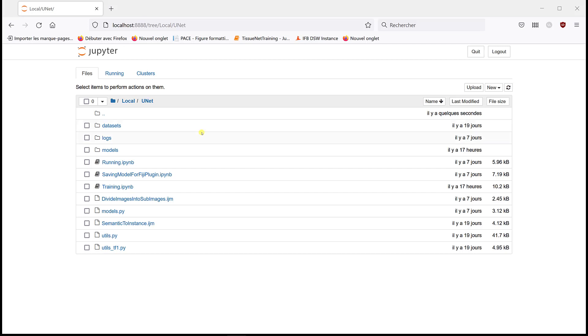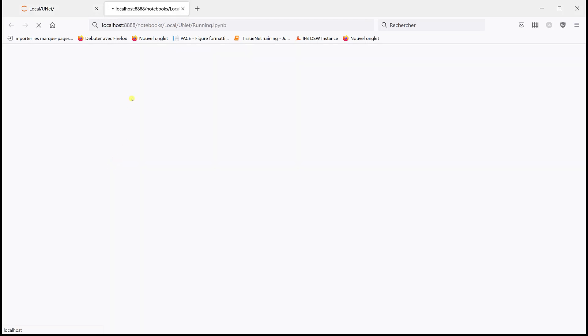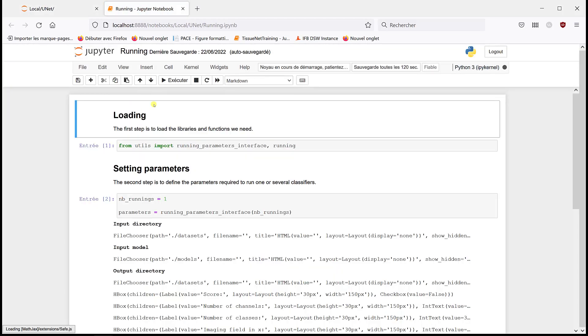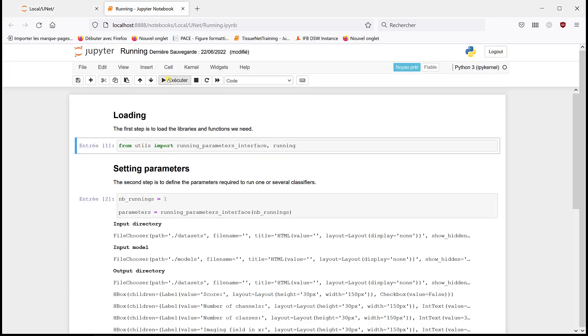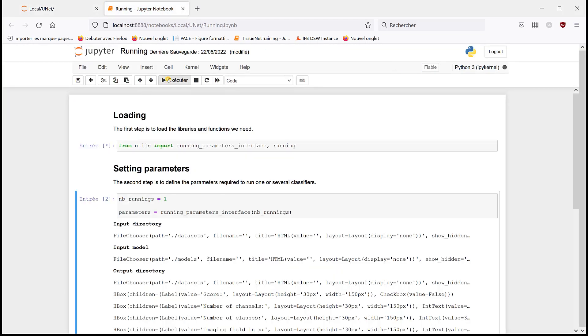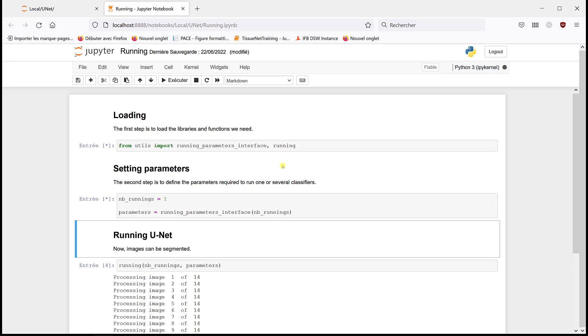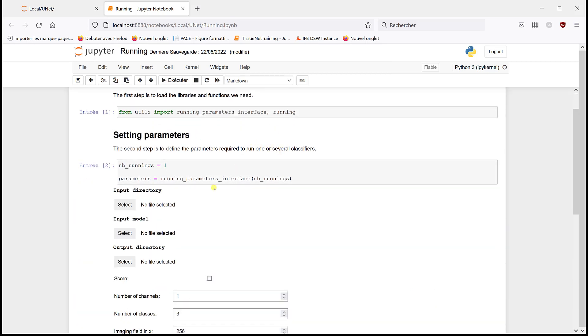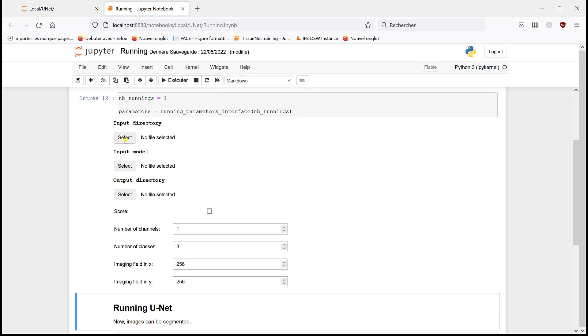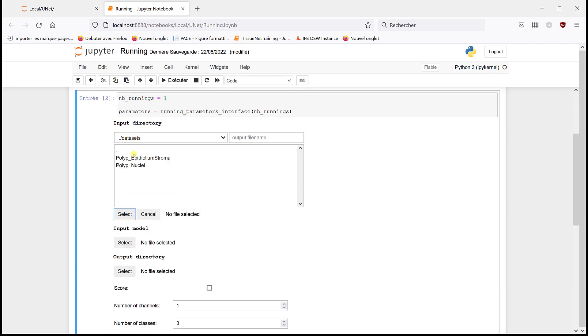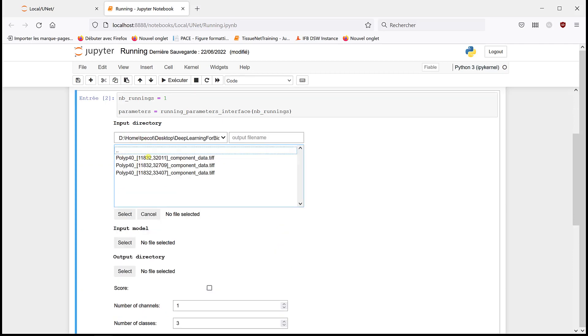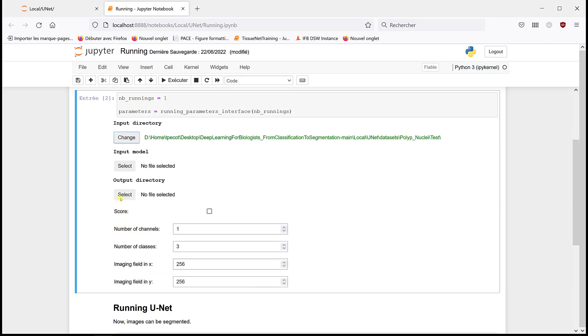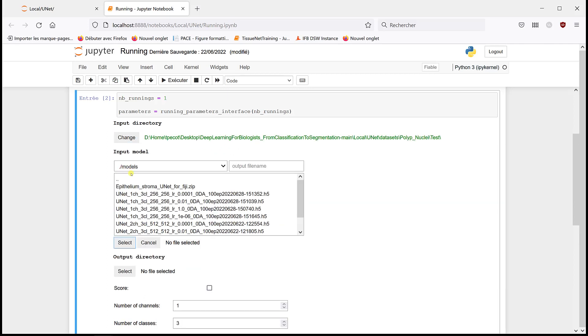So we trained the U-Net model, now we can try to process images. I'm going to open the running notebook. In that case, I'm going to define polyp nuclei. We have a test folder with three images that we want to segment, so I'm going to select this folder.